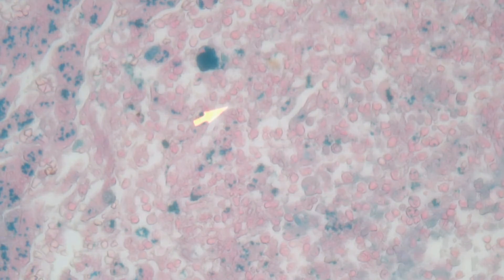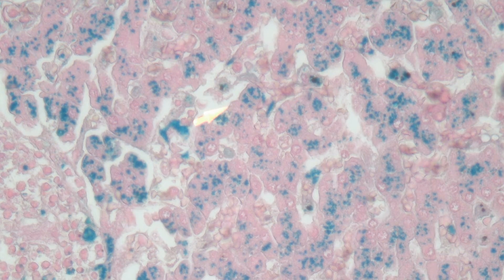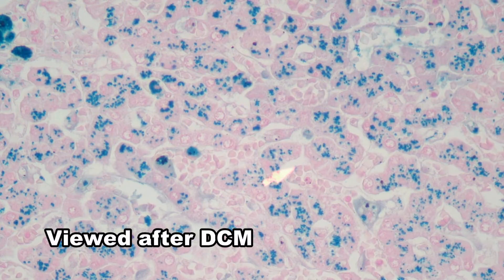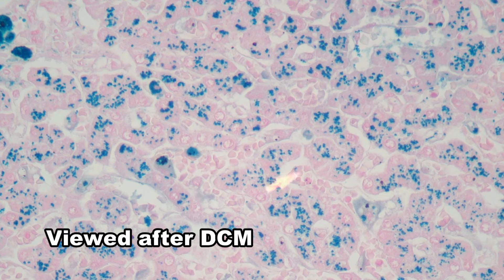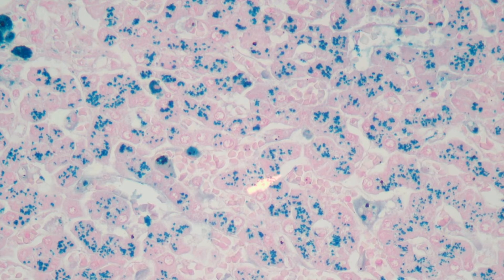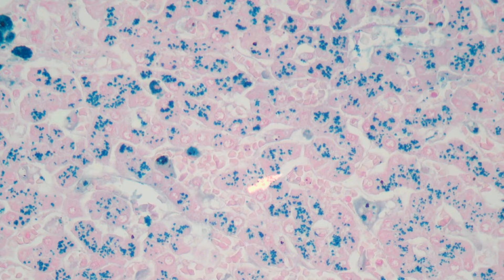Obviously we get better optics once this has been dehydrated, cleared and mounted. Now switching over to the final view, we can see here in the final mounted slide a really lovely demonstration of hemosiderin, which more precisely is showing us Fe3+ ions.